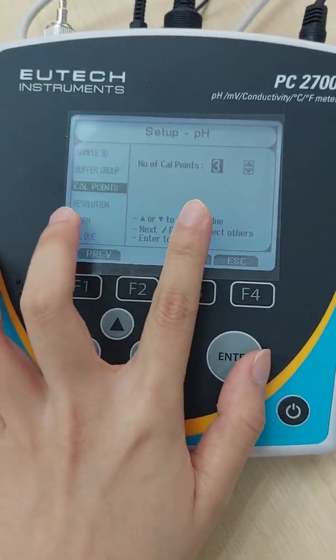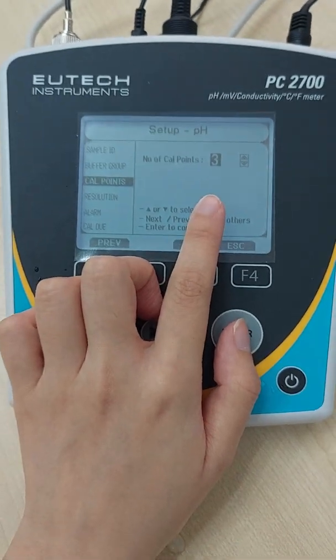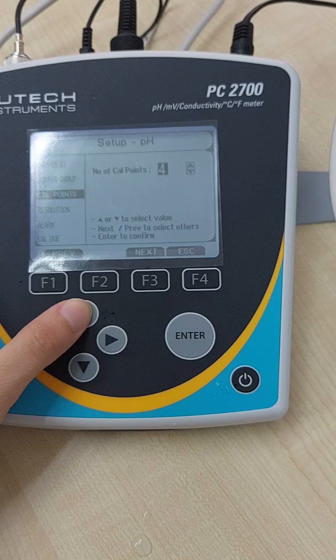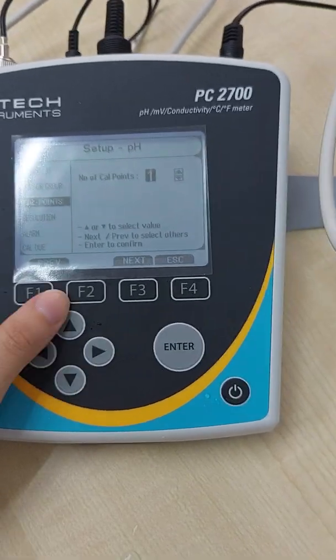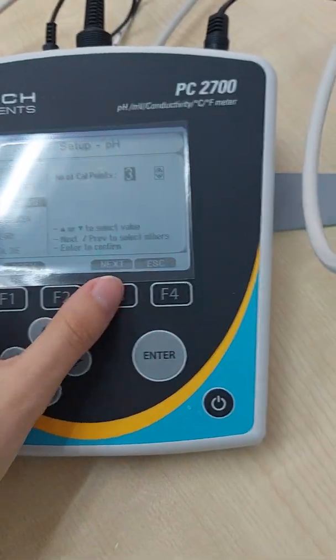Cal point. We recommend customer to perform calibration, three point calibration, which is the four, seven, and ten. However, you can also go up to four, five, or back to one, two point. But standard one will be three.